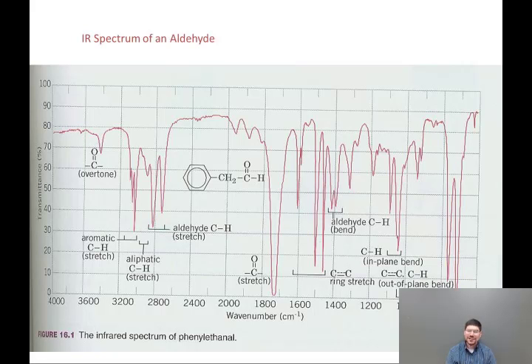And you can see that carbonyl stretches occur generally in the region of 1650 to 1800. Most of them are clustered very close together between 1710 and 1740. So you can see the big, strong stretch going all the way down to the bottom of the spectrum, the big, strong peak, that is, corresponding to the stretch of the carbon-oxygen double bond. That is, as I said, very characteristic. In aldehydes, ketones, esters it is generally right there around 1720 or so.